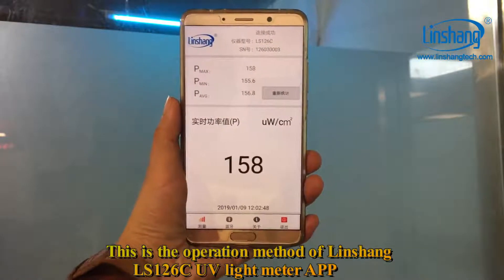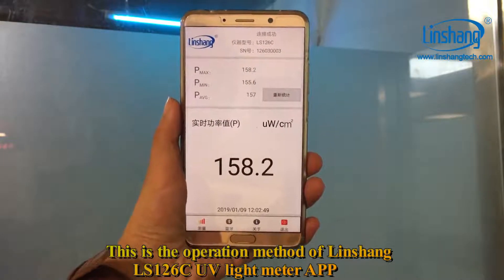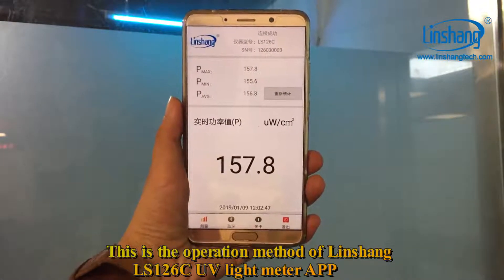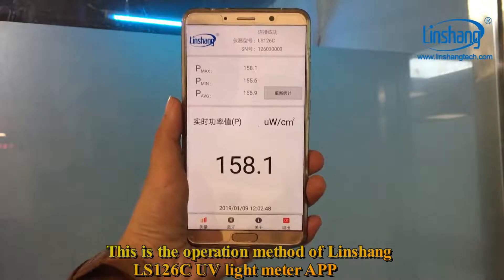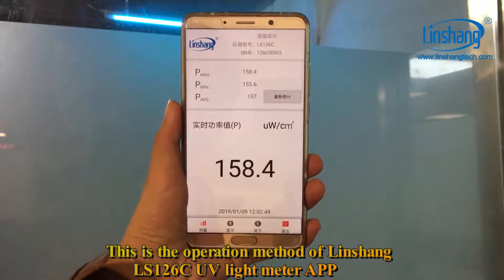This is the operation method of the Linshan LS126C UV light meter app.